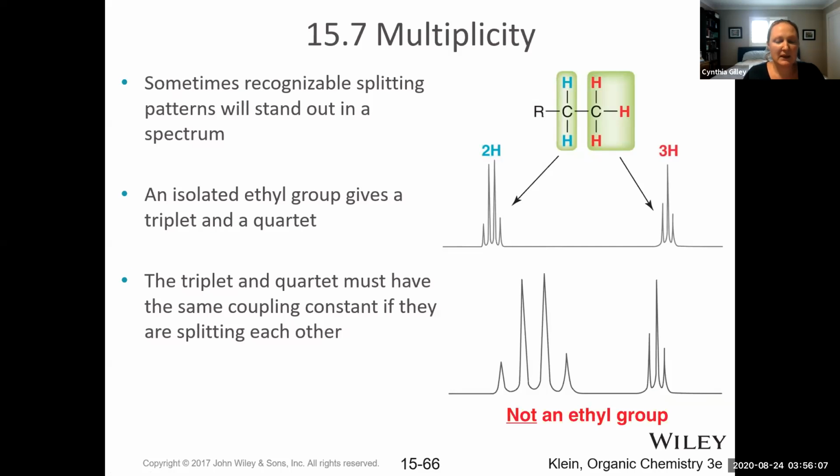Okay, here are some helpful hints for analyzing spectra. These are super important because they're going to help you do it faster. And speed is a thing, right? Because when you're taking a quiz or a test, you have a limited amount of time. So if you're too slow at this, it's going to be a problem. So one of the things to do is just practice, practice, practice, so you're a lot faster. And recognizing these patterns is a real helpful thing to do.